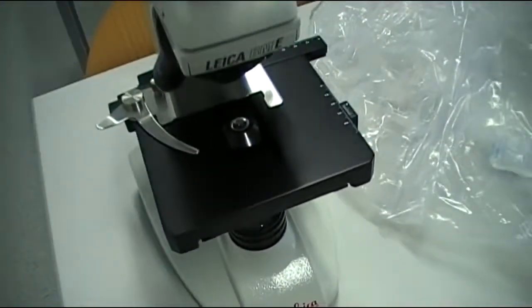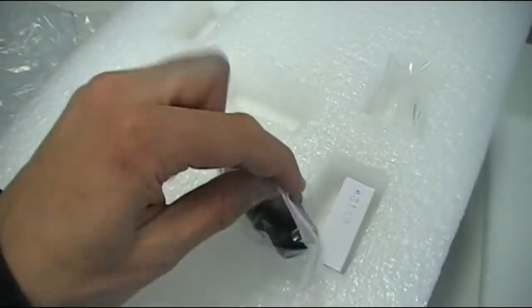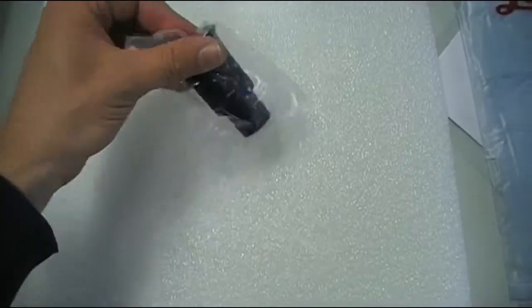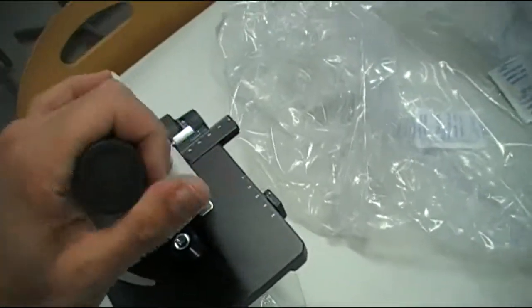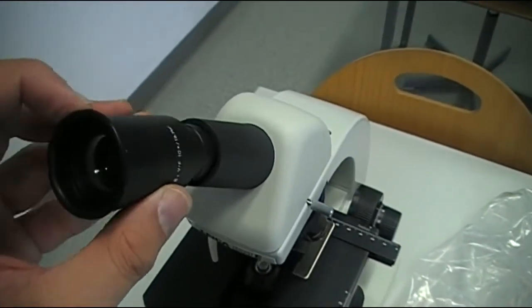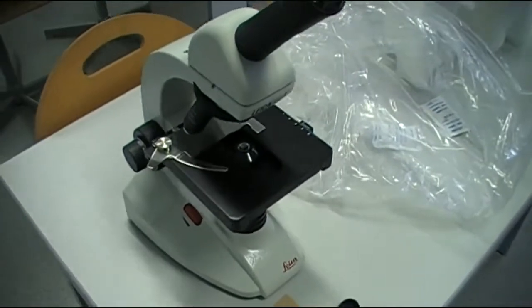Looks very nice. Now for the eyepiece — I have to somehow take it out here with one hand only, that's quite a challenge. Better not drop it. How is this closed? Ah, over here there is a nice cover, and we drop it in here.